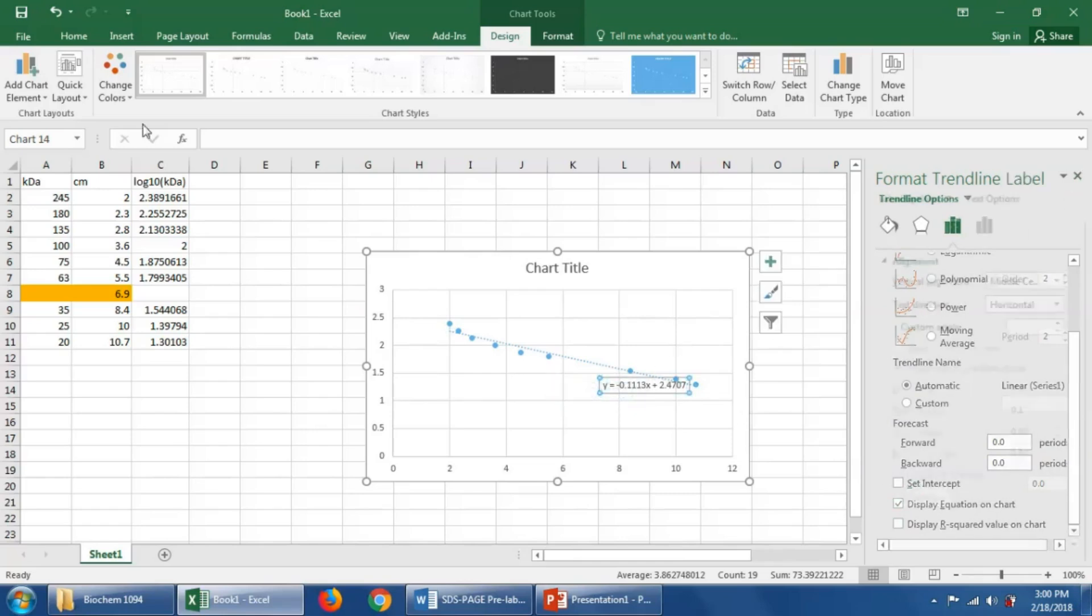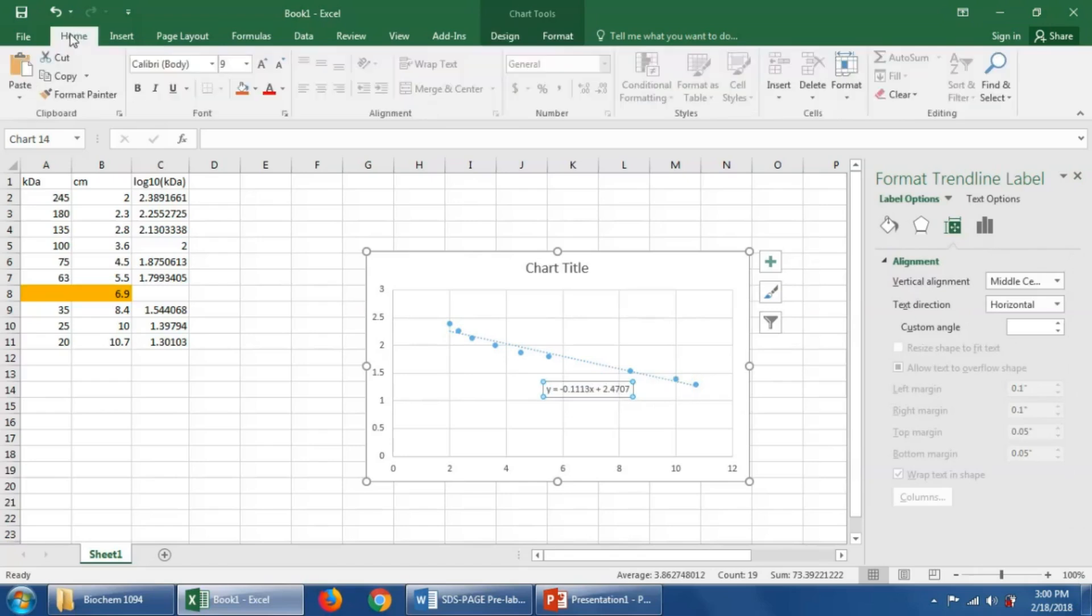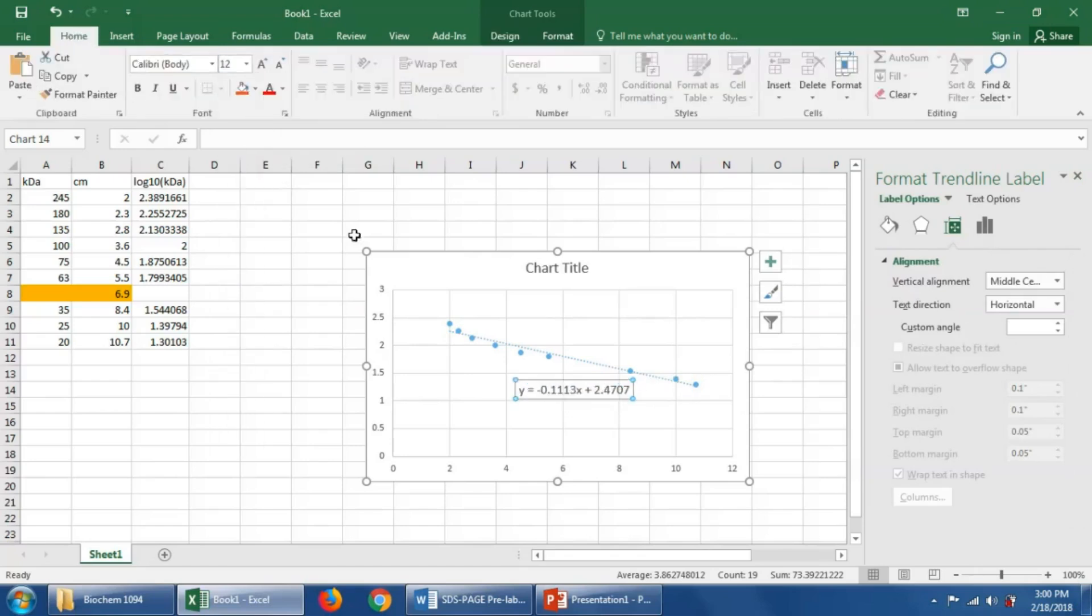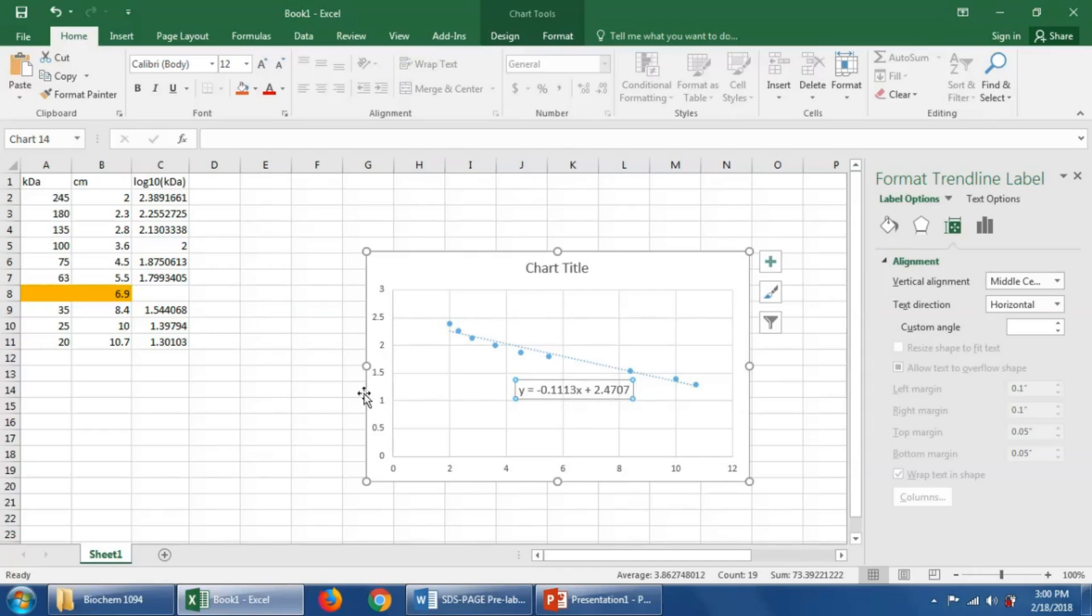I'm going to make this just a little bit bigger so that it's easier to see on this video. We could use this equation then to calculate the log base 10 of the kilodaltons for this band that migrated 6.9 centimeters. This method is acceptable.